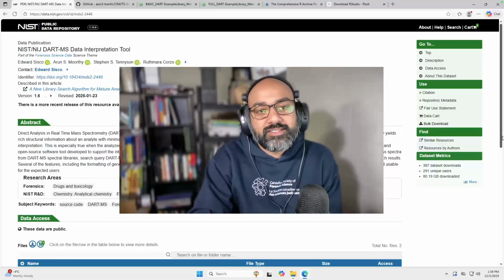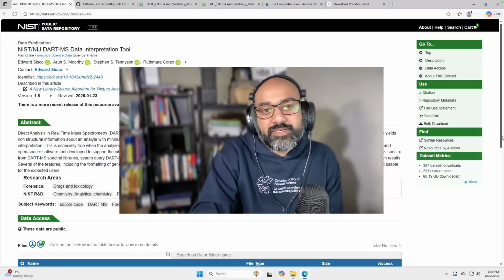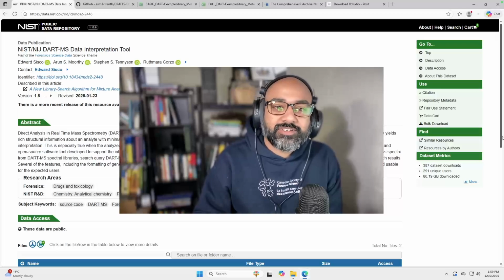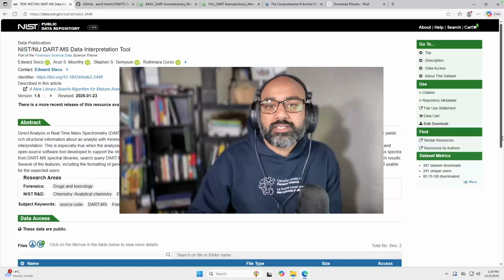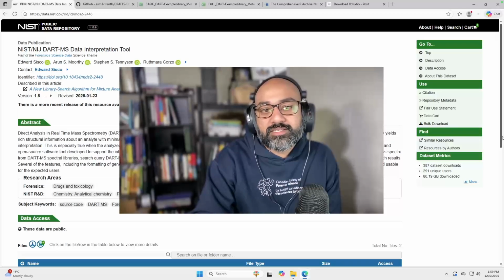Hey everyone, in this tutorial I'll be showing you how to use the CraftsLab DART-MS Spec or database builder tool, or database builder program I guess we're calling it. This is a way for you to build your own in-house custom DART-MS Spec libraries to use with the NIST NIJ DART-MS Data Interpretation Tool.